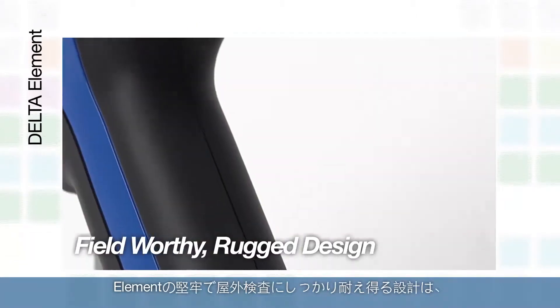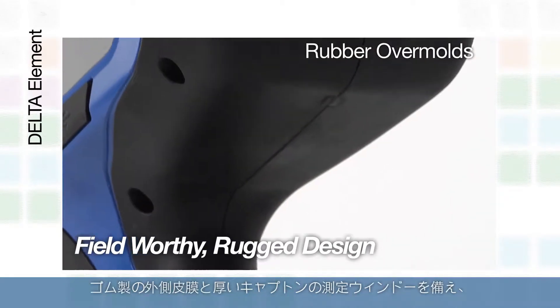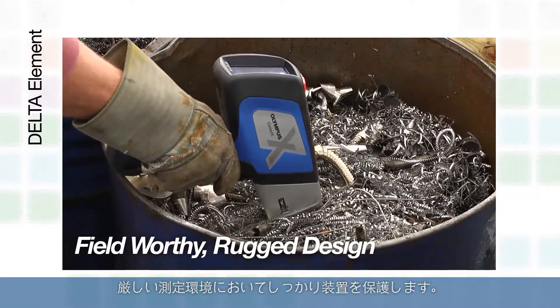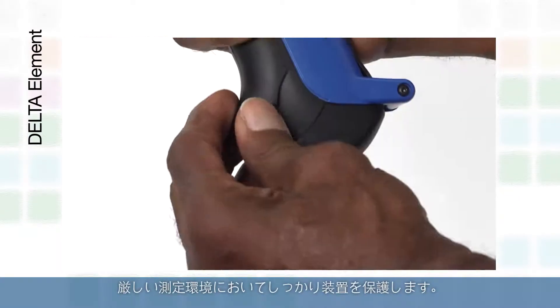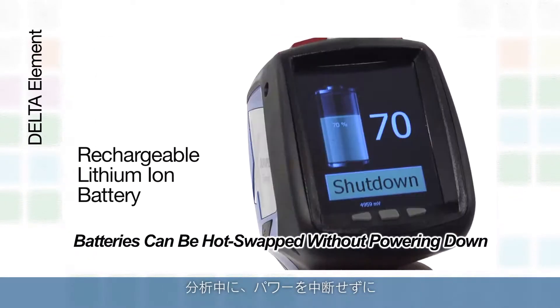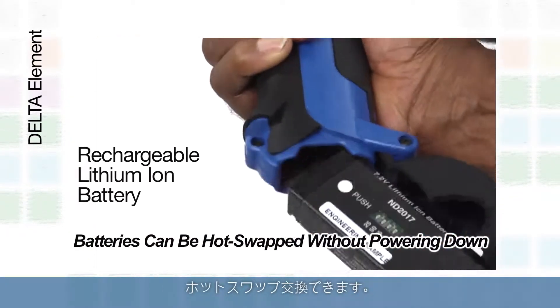The Element's field-worthy and rugged design features rubber over-molds and a thick cap-on measurement window to protect the analyzer in tough processing environments. The rechargeable lithium-ion batteries can be hot-swapped or changed without powering down the analyzer.